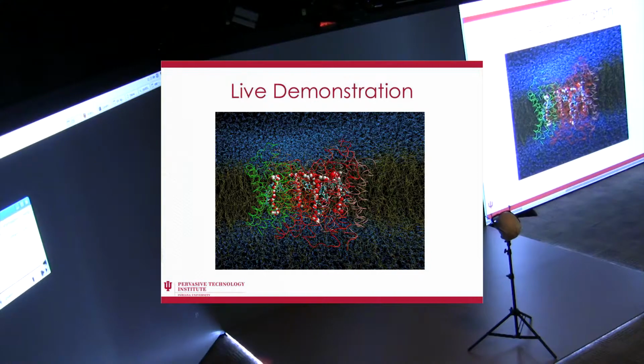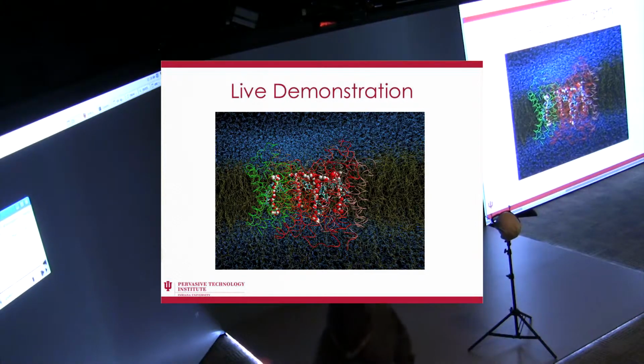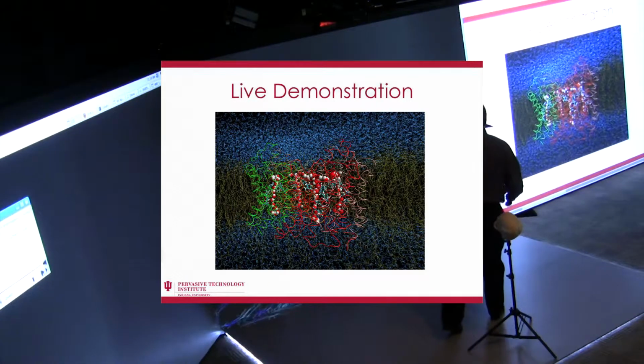All right, so let's do some live demonstrations. Let me get my wand over here. Like I said, it's pretty light on VR. If you have your glasses on, head tracking is on, and I can walk around it.